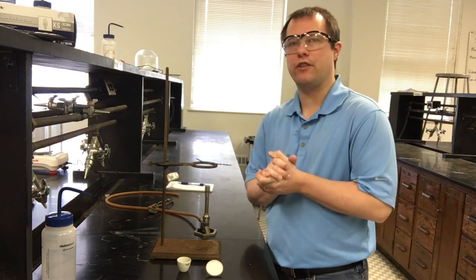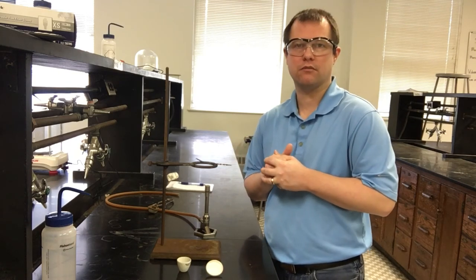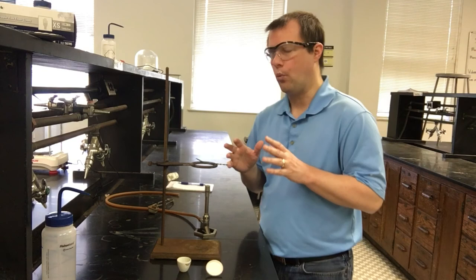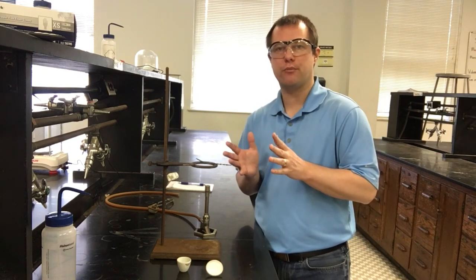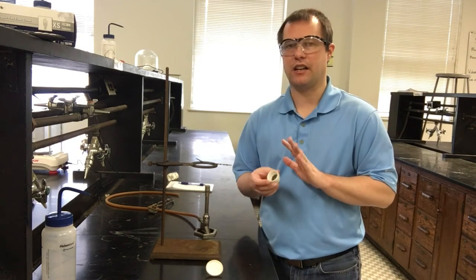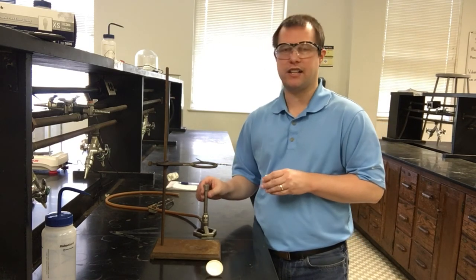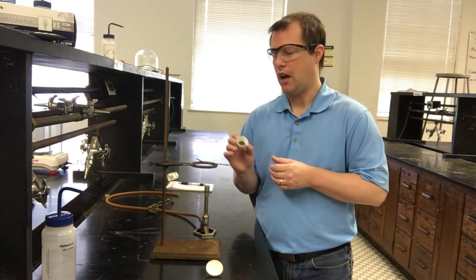Welcome to another week of our online video demonstrations for the Chem 1211 lab in North Georgia. I'm Dr. Meyer and what we're going to be looking at today is the empirical formula experiment. We'll cover setup for using crucibles to burn magnesium, as well as setting up and using our Bunsen burners.